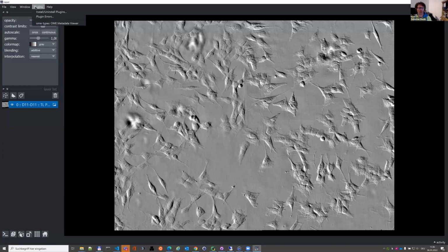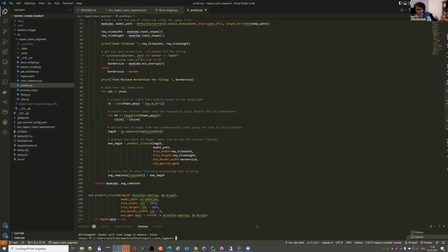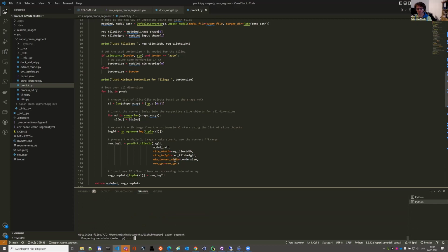And now we start our plugin. Oh, I forgot to install it. I'm in the wrong environment. My mistake. So then here, pip install -e. So I install the plugin.